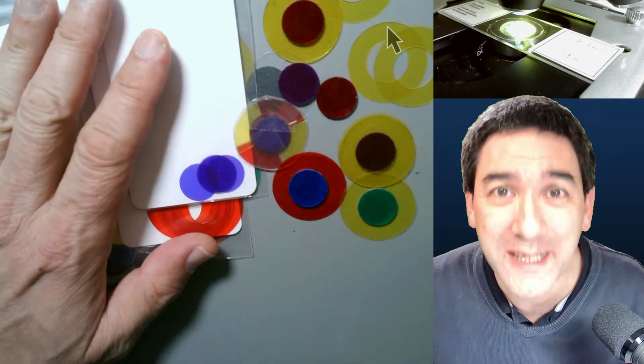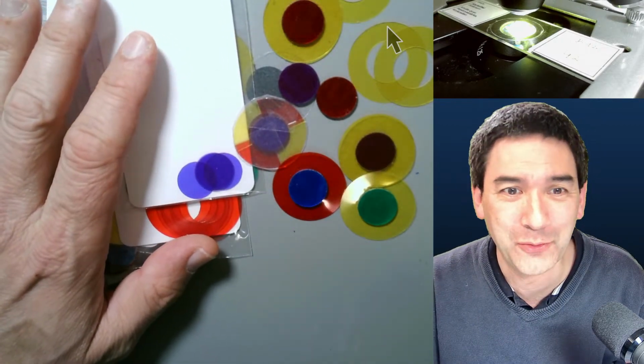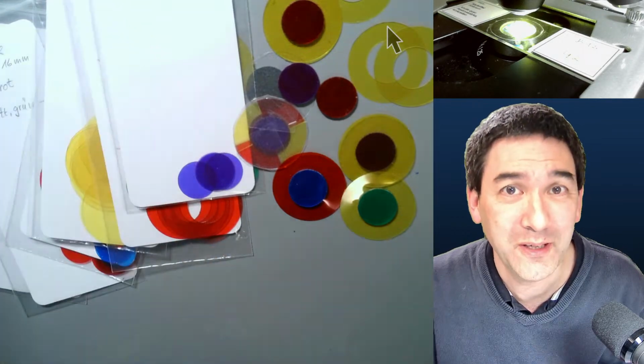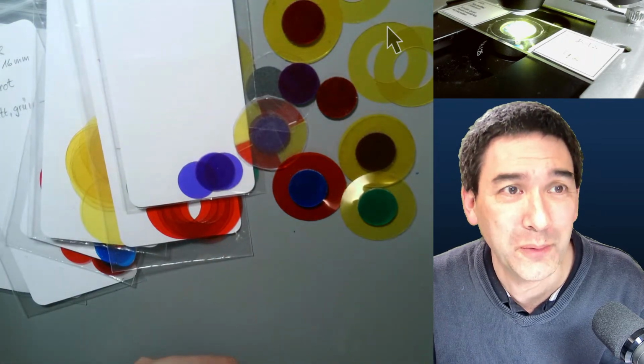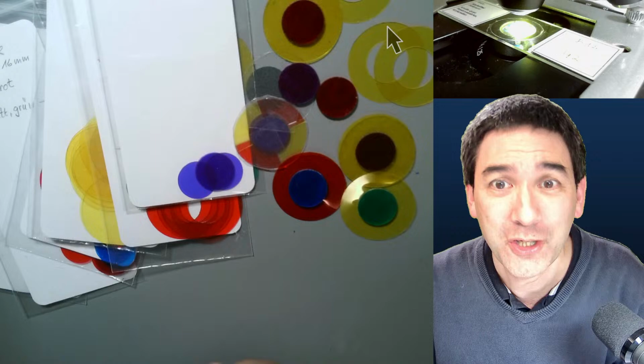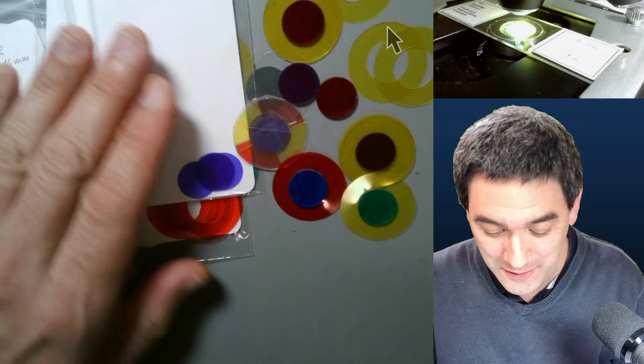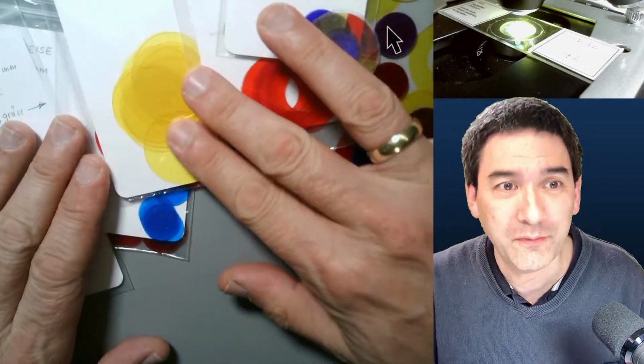These are Rheinberg filters for microscopy. And I would like to present them today to you and show you a little bit what little magic you're able to do with those Rheinberg filters. They're pretty nice, pretty neat, and you see quite a variation here.